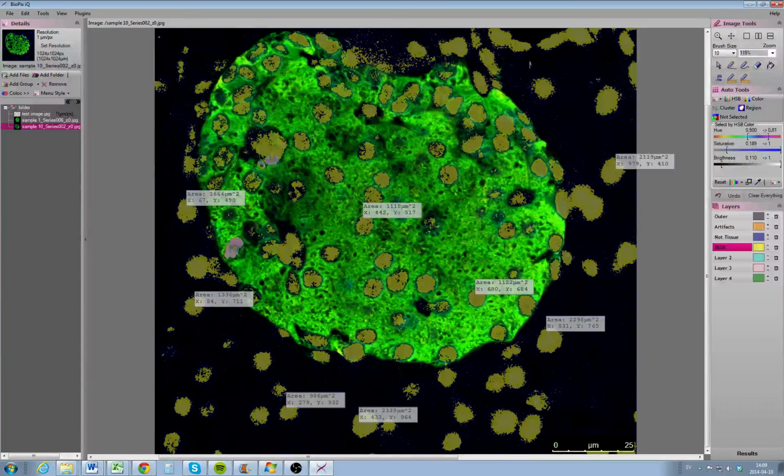And we will ask the program to, if it finds an object that is much greater than 2500, subdivide that object into several cells, since it's clustered like this. So this particular one will be composed of 2 cells, or 2.5 cells instead.